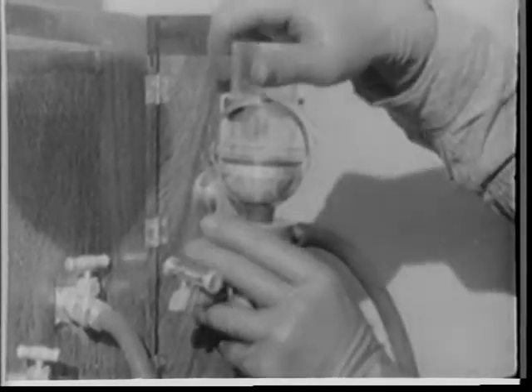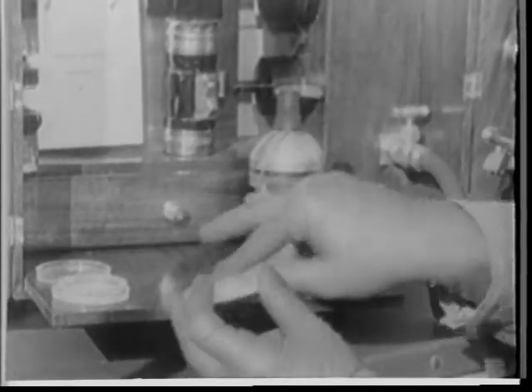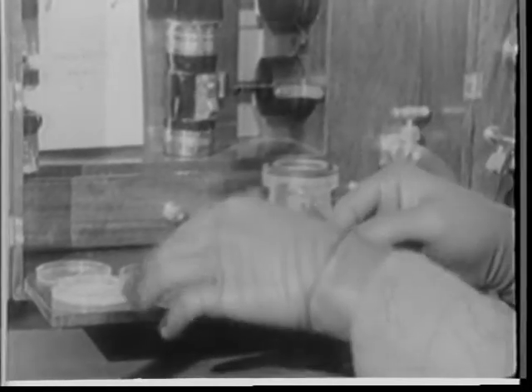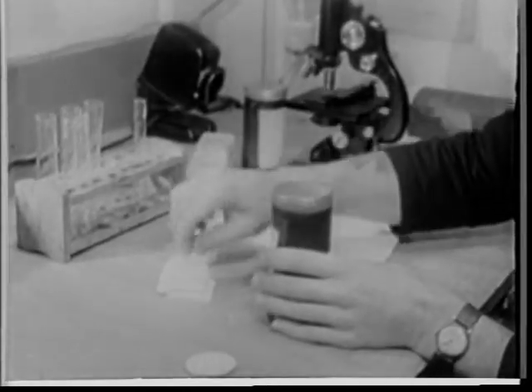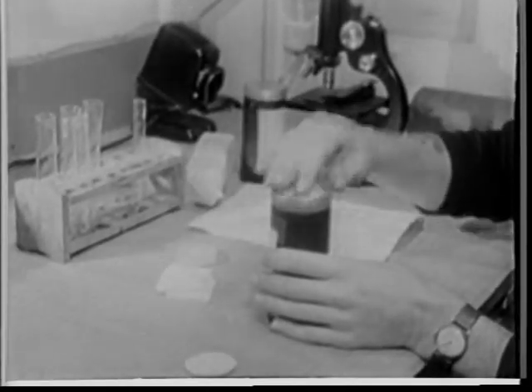After all the liquid is drawn out, the bacteria-laden filter is removed and returned to its container. Both filter containers are kept. The liquid from the impinger is also put in a container and the samples are prepared for shipment.